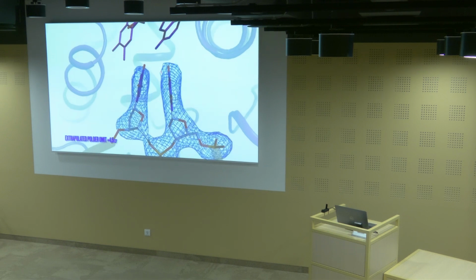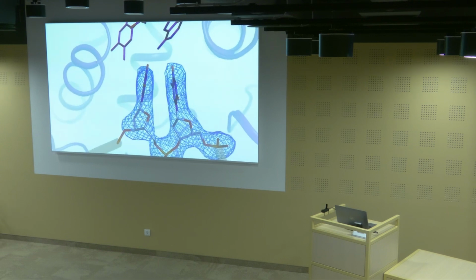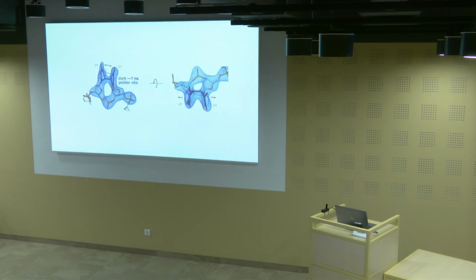At longer pump probe delays, we can see that these now restored thymines become much more planar. And so in this case, I think it's remarkable because really what we've seen is chemistry in action, right? Bond breaking driven by this enzyme.